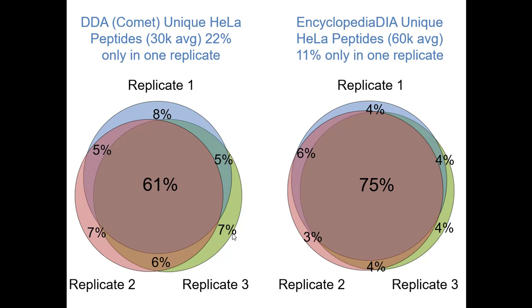And for the low abundance stuff, the proteome is vast enough that there are bunches of peptides down at that lower range. And today you might sample one of them, and tomorrow you might sample a different one. And so the whole set of this is actually probably more representative of what the proteome is than any one of these individual scans. With DIA, we end up acquiring the same precursor isolation windows one after another every time.